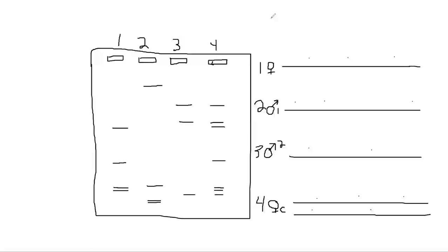Now we're going to look at another real-world application of this technology. Specifically, we're going to look at paternity testing. You could also use this technique that I'm going to show you to identify DNA from an individual at a crime scene and match it to that person's DNA sequence.